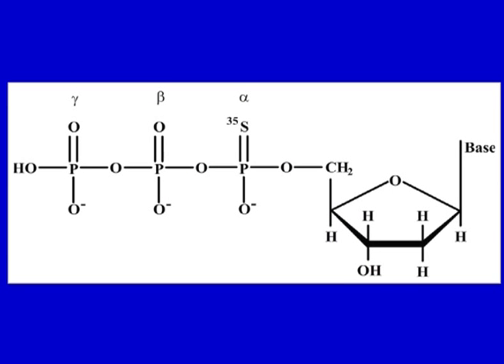So, there is no problem about that, and it is incorporated into the growing DNA chain. Now, non-isotopic detection methods have also been developed with chemiluminescent, chromogenic or fluorogenic reporter systems. Although the sensitivity of these methods is not as great as with radiolabels, they are adequate for many different purposes. You can see here this 35S incorporated at the alpha position.